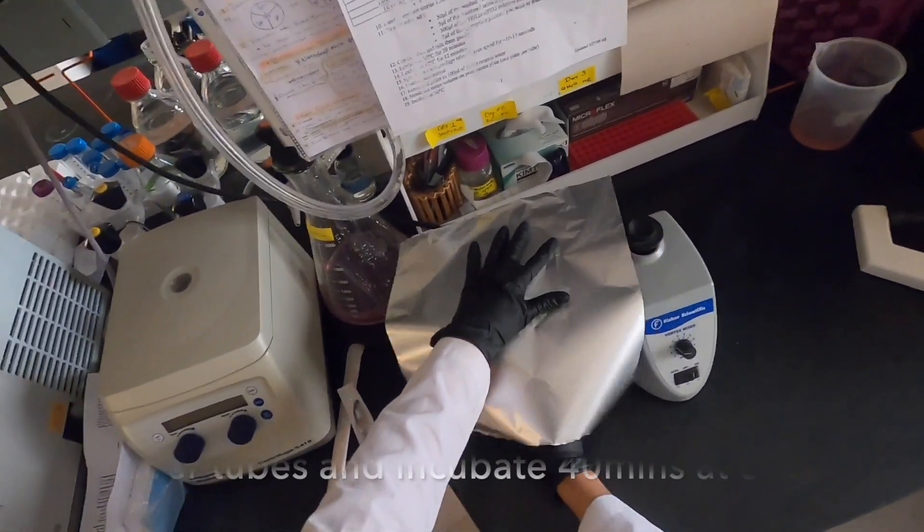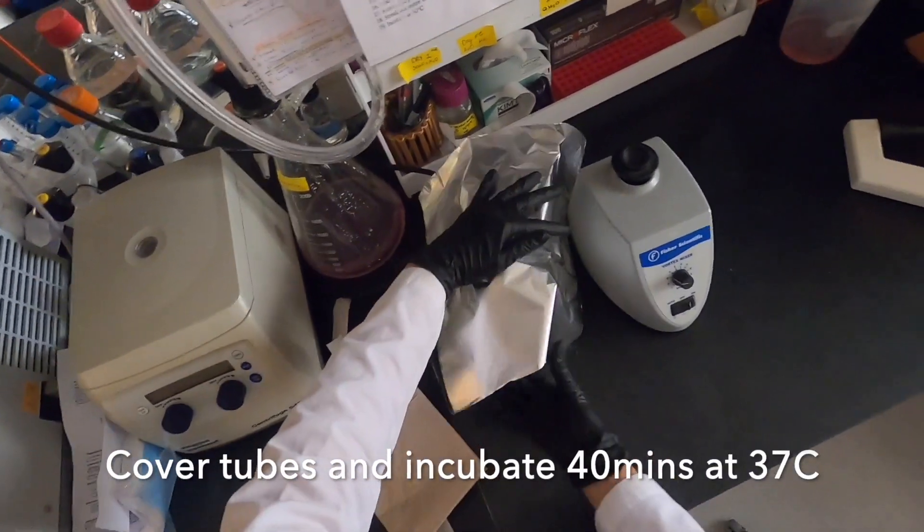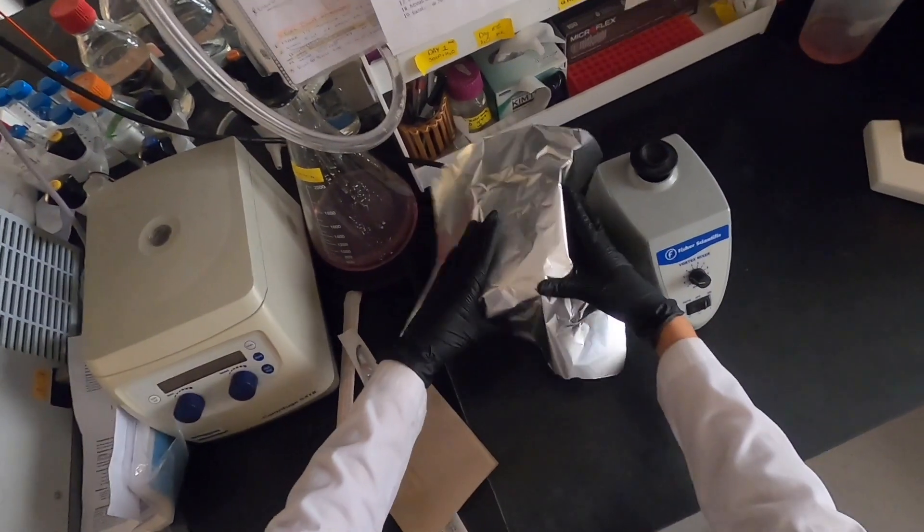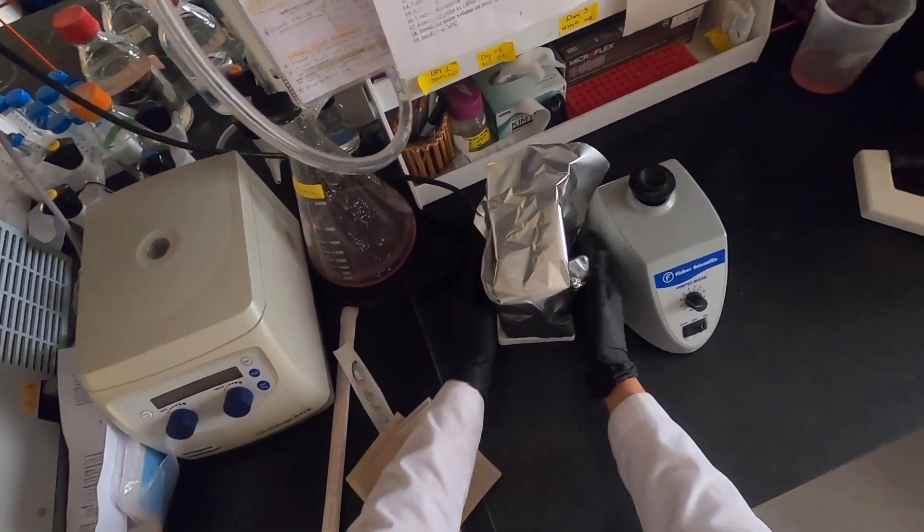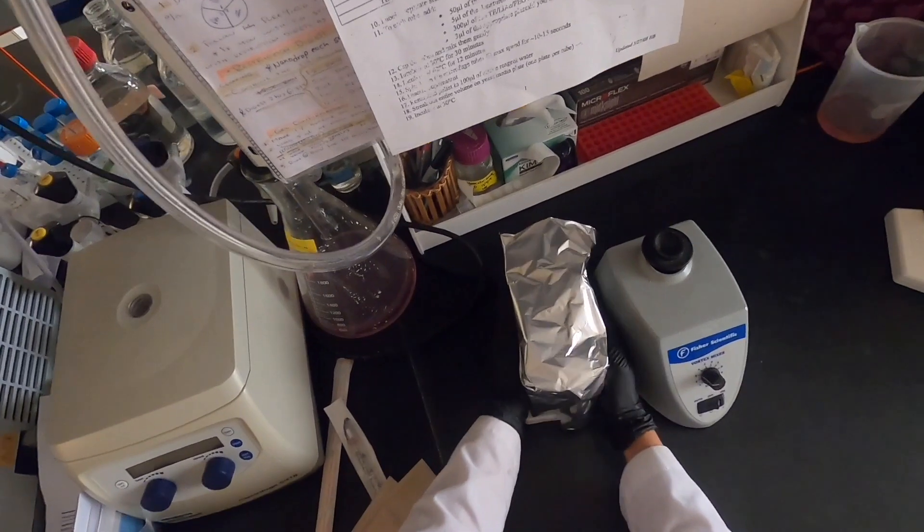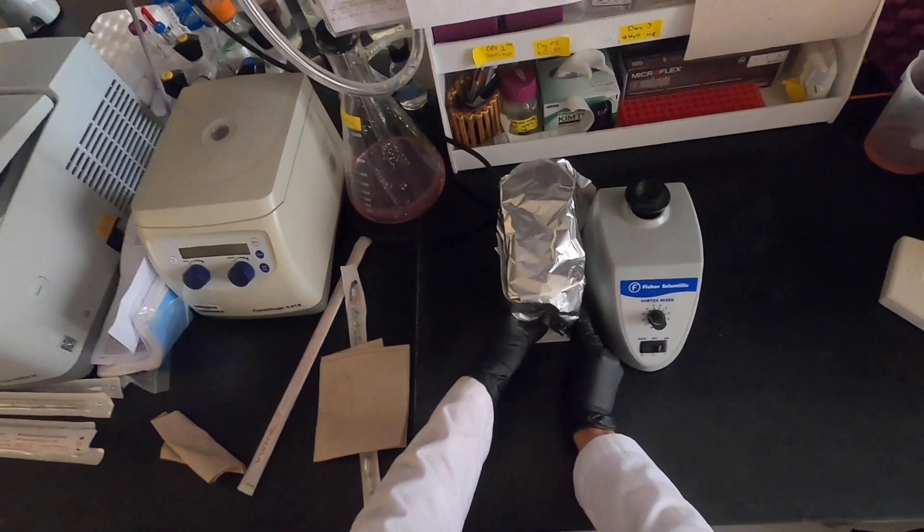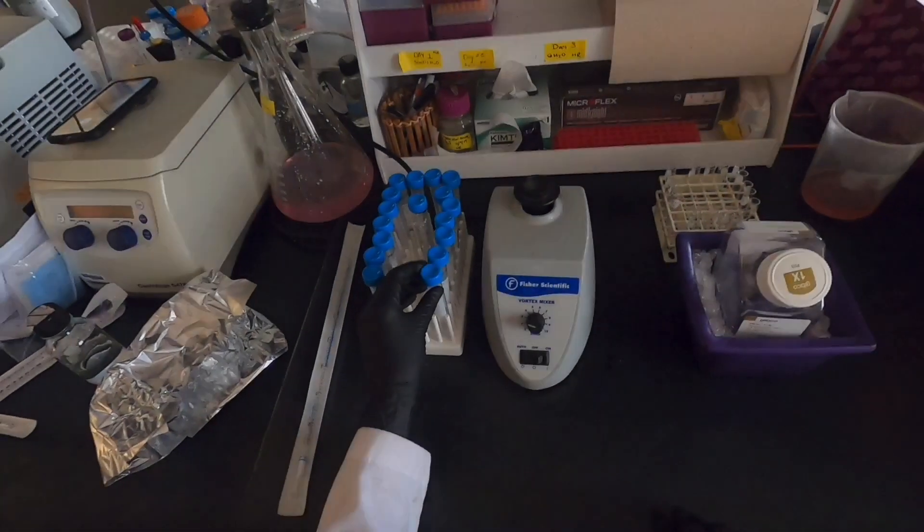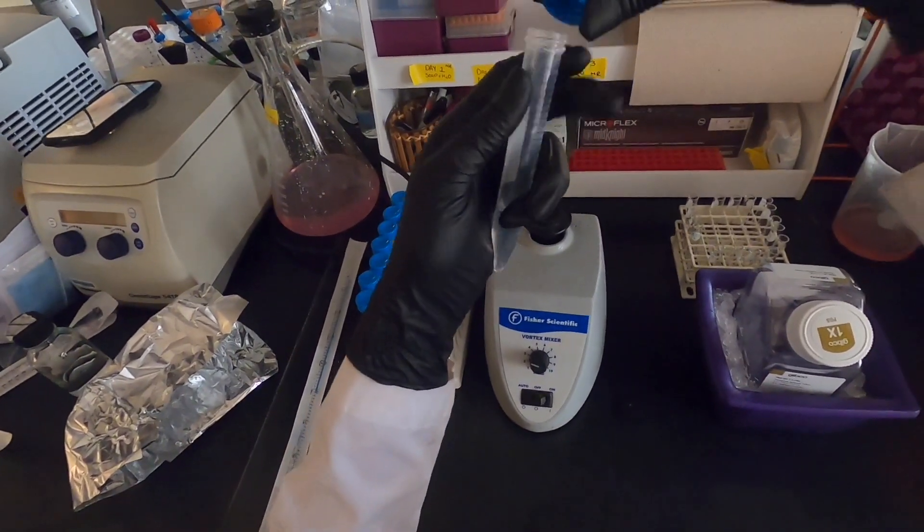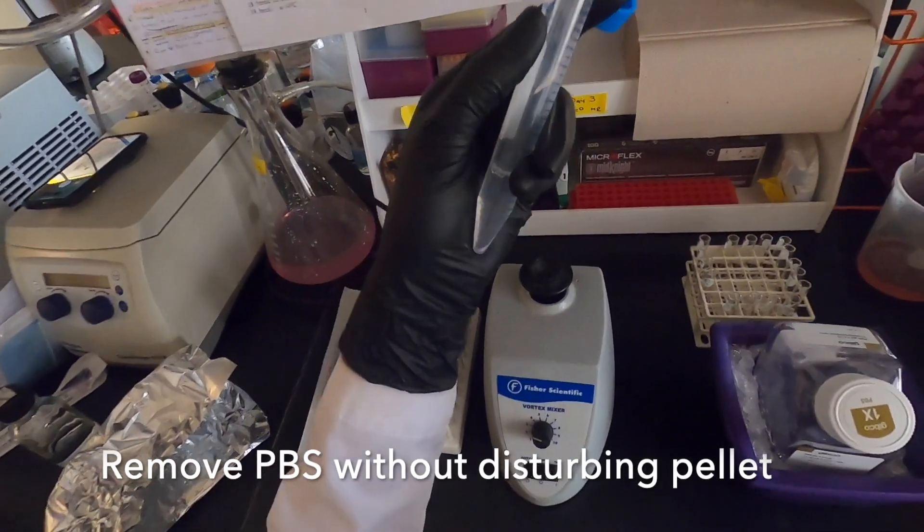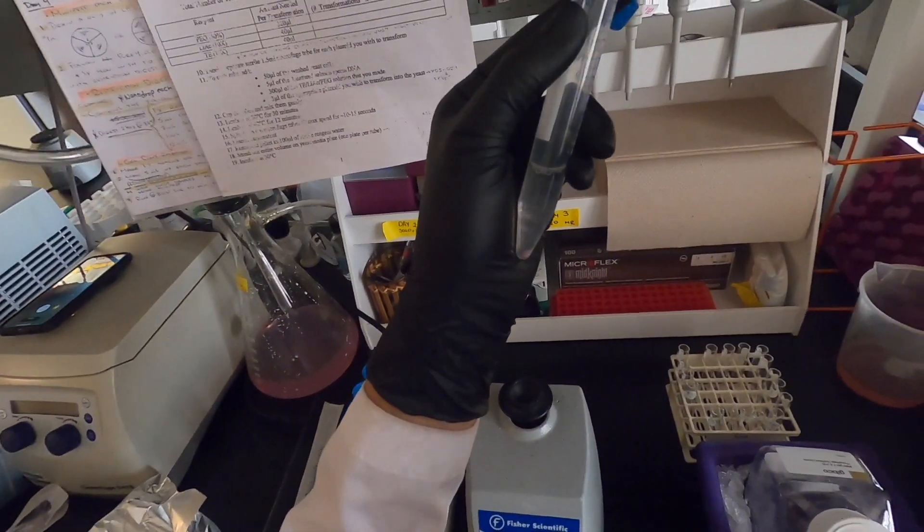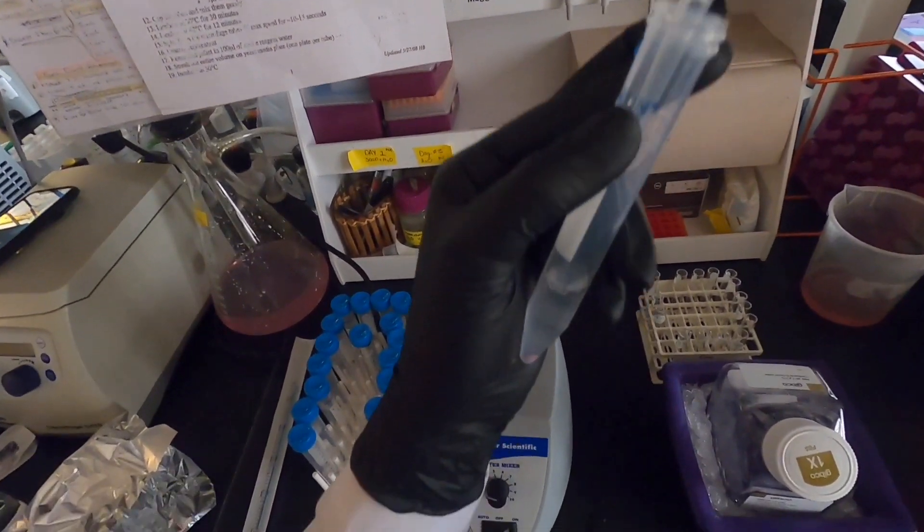Now we will incubate our cells with PI for 40 minutes. We are almost done with our experiment. We are now just adding 3 mLs of PBS and following up with the centrifugation. In order to remove the PBS, we will once again pipette out or aspirate gently in order to prevent disturbing the pellet.